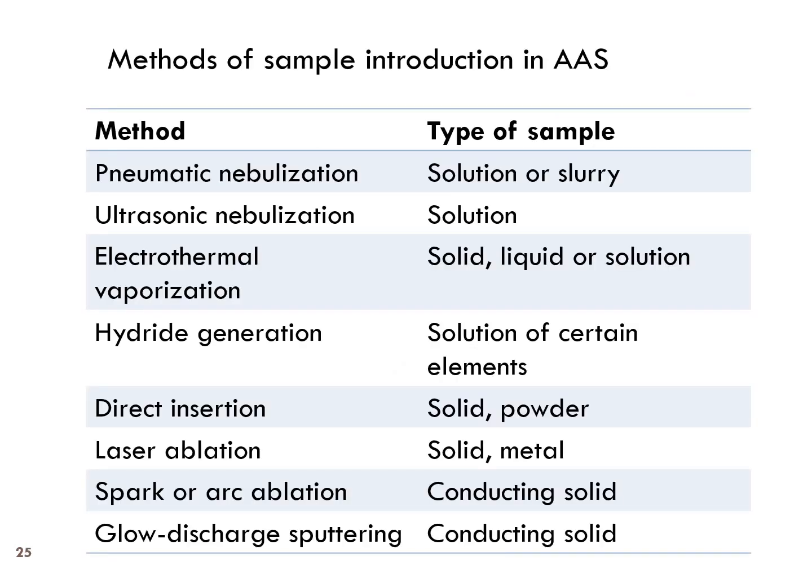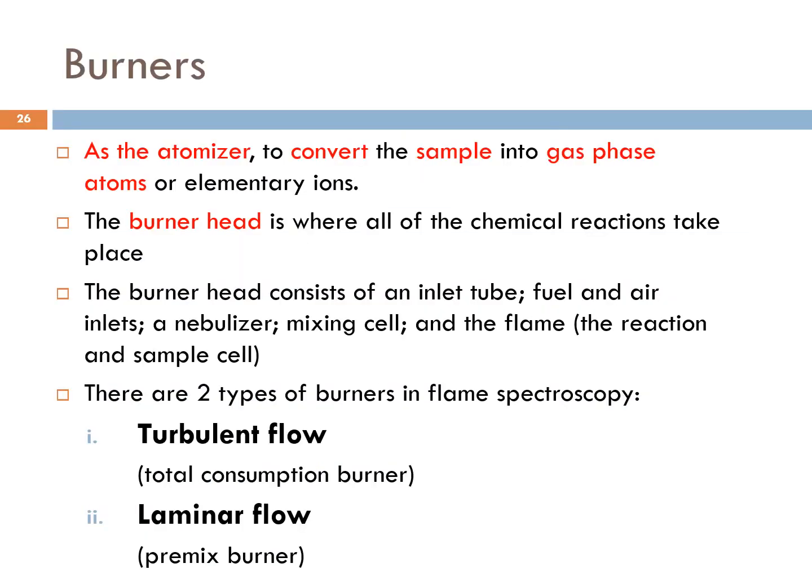Okay, methods of sample introduction in AAS. There are a few methods which depend on the type of the sample. Kalau solution, kita guna nebulizer ni. Kalau untuk solid, kita guna 2 ni, 4 ni. Macam tu lah, depends on types of your sample.